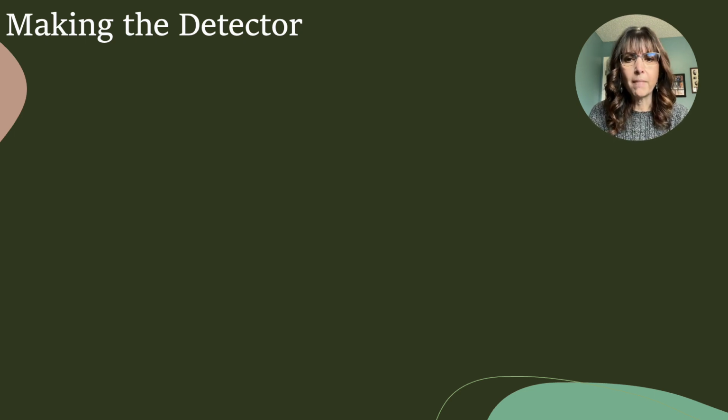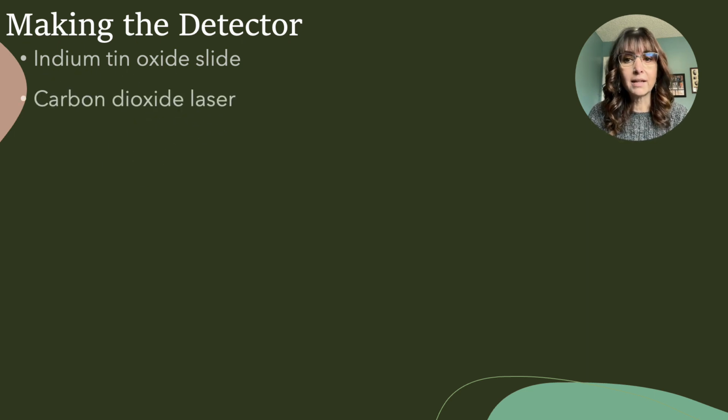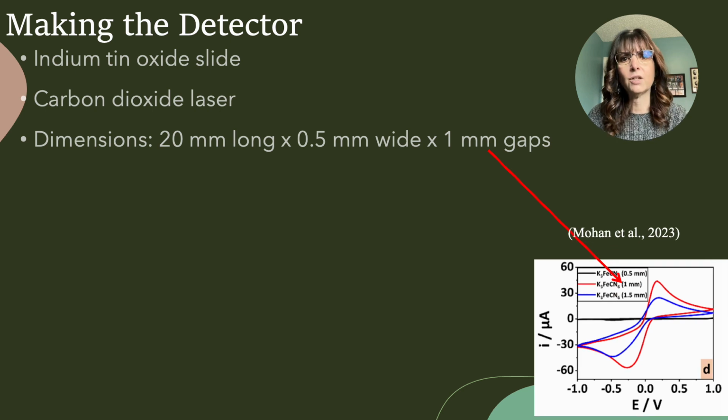Remember, they wanted to use microfluidics, which just means etching microchannels on glass that can direct and move water samples. They chose 5 centimeter squared glass indium tin oxide slides because they were transparent, versatile, and conducted electricity. They used a carbon dioxide laser to etch the microchannels into the glass to form the 3 electrode channels. Now this is where it gets interesting.